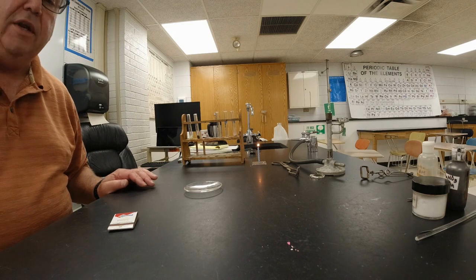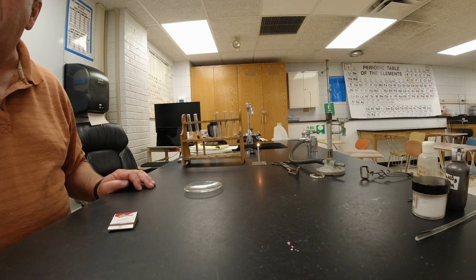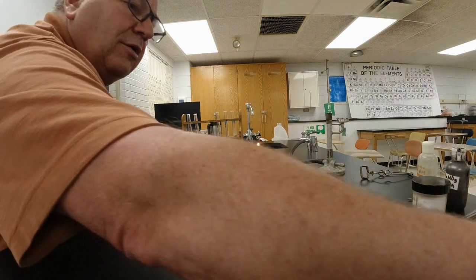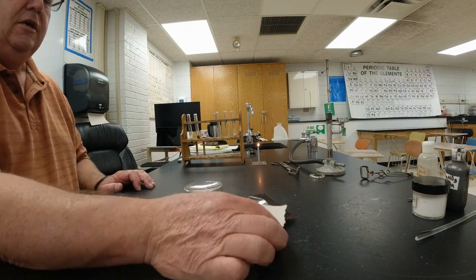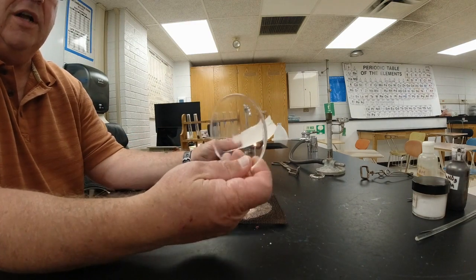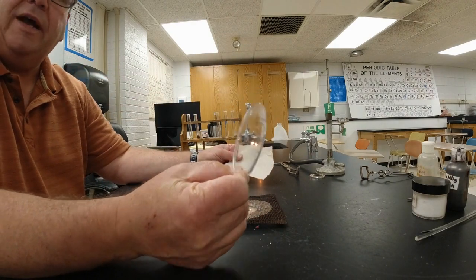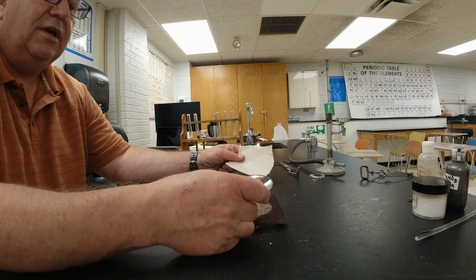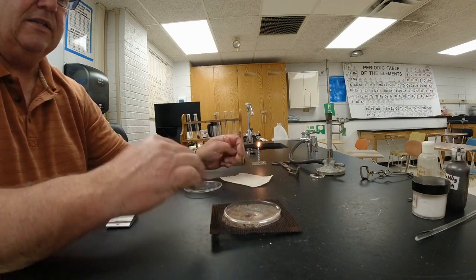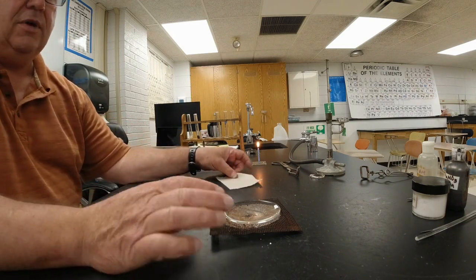All right, so if you need to record any observations, you should be doing that. Number 3, it says take a small piece of paper towel and tear it into pieces and put it on a watch glass. So here is a small piece of paper towel. This is a watch glass. It's called a watch glass because it actually looks like the glass you would have over the face of a watch, like this. This is a wire screen, and we're going to use this to insulate the table from anything that is burning. It protects the table a little bit.